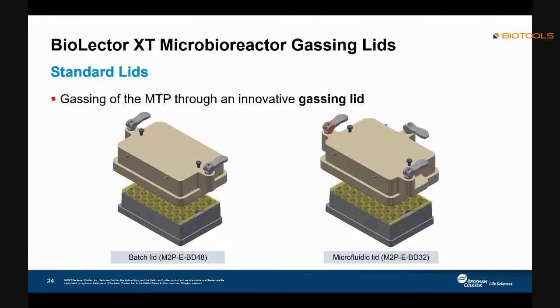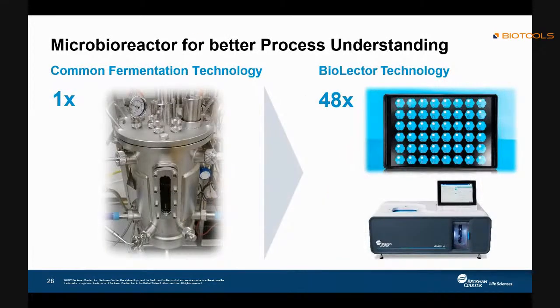And maybe you will ask how and why we do the measurements. I will talk a little bit about the technology. In the common fermentation technology you're using now, maybe you're using this kind of bioreactor, so you can only do one measurement or one fermentation at a time. But what we are using is a 48 well plate. So you can see that means you are doing 48 fermentations at the same time.